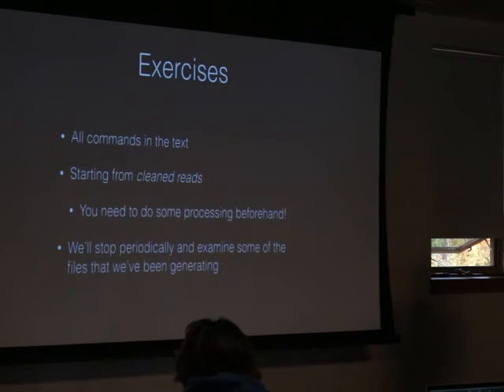And then, depending on how things go, I'm going to stop periodically and show a little bit about the data structures. These big files are a bunch of gigabytes. They take up a lot of memory when you execute them, and a lot of hard drive space. They look scary, but they're not that scary. In fact, they're very good data structures and pretty efficient with respect to being read by programs and even being read by humans, given that you know how to scale.